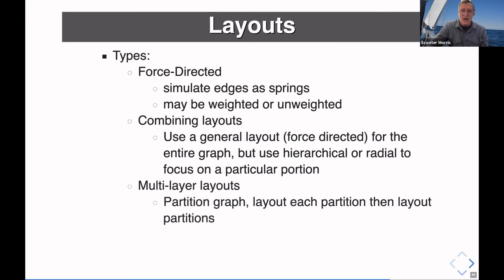Multi-layer layouts partition the graph and you lay out each partition. There are a number of different algorithms that do this, and there are many, many other kinds of layouts. Several apps exist that do layouts. There's the whole suite of yFiles layout apps that you can download.